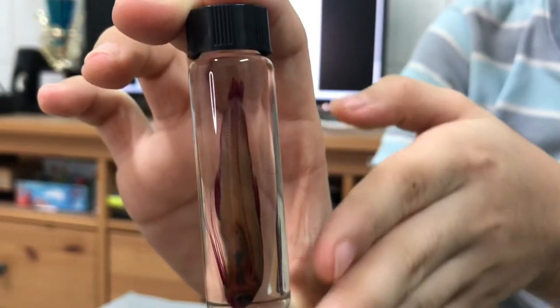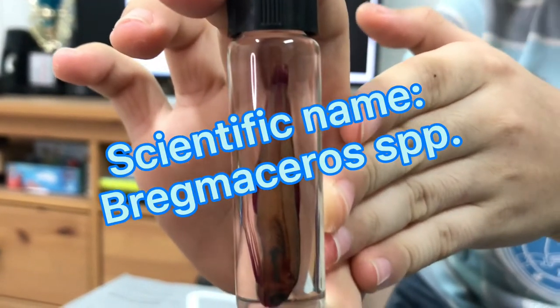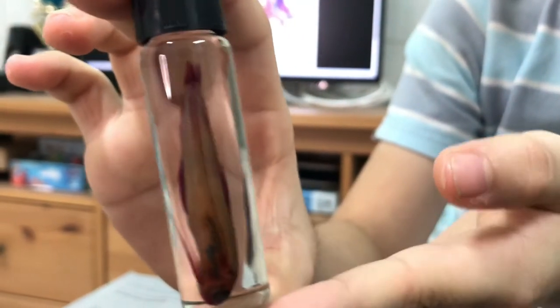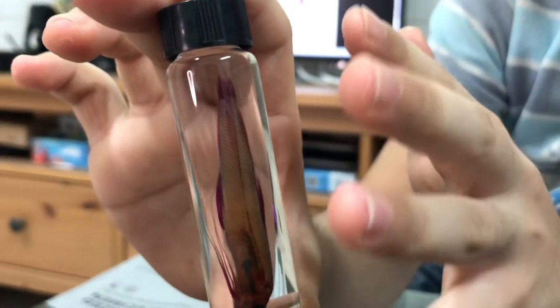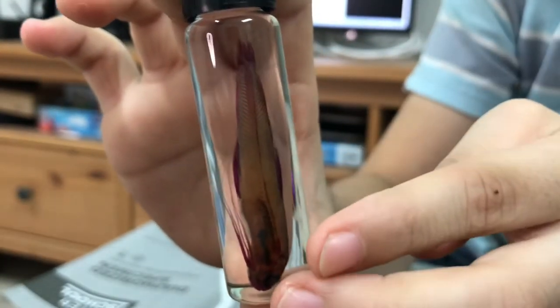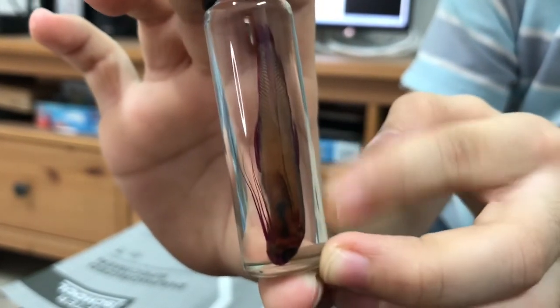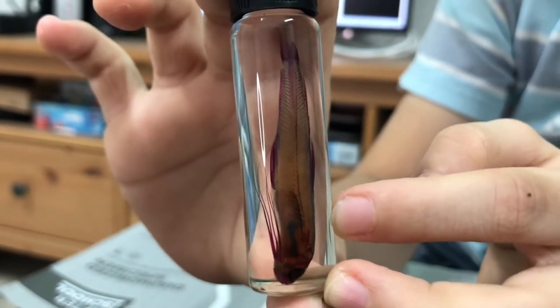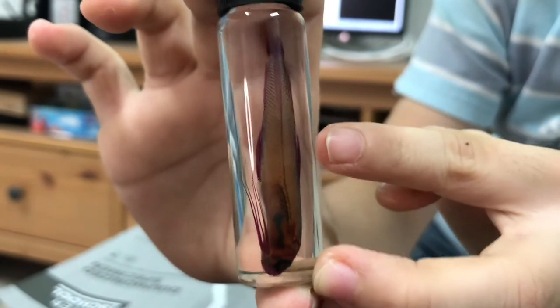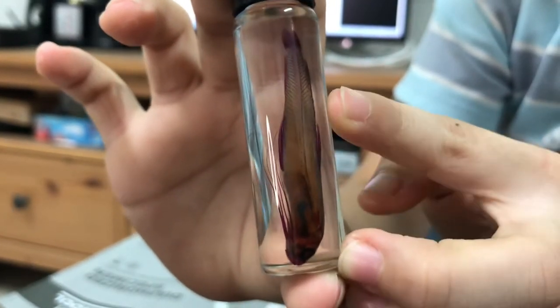Now I'm going to talk a little about this fish specimen, which is called Brygmoseros. With this species, you can discover closely the art of diaphomization — you can see that it is a bit transparent. You can actually see the red bones, which is the color I dyed. And inside there is also some blue, which represents the cartilage, and the red is the antenna-like fins and its bones.